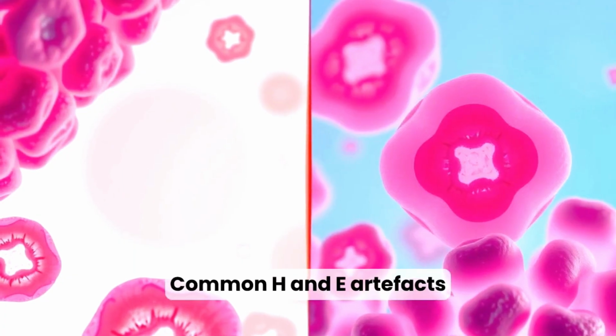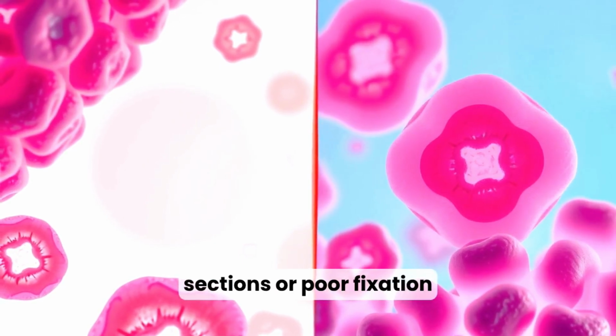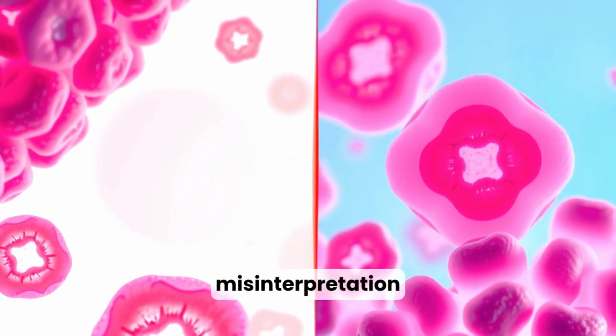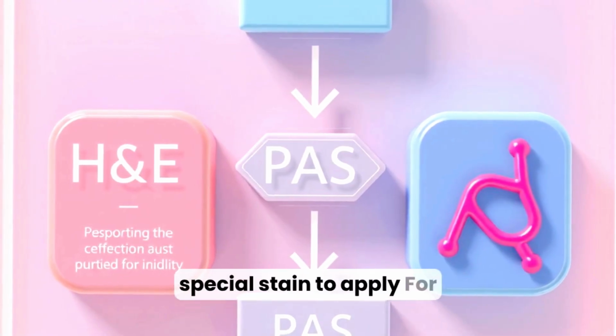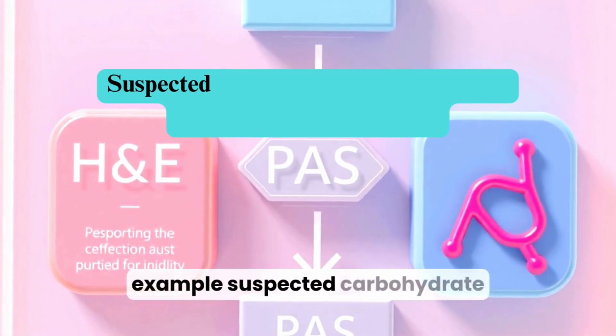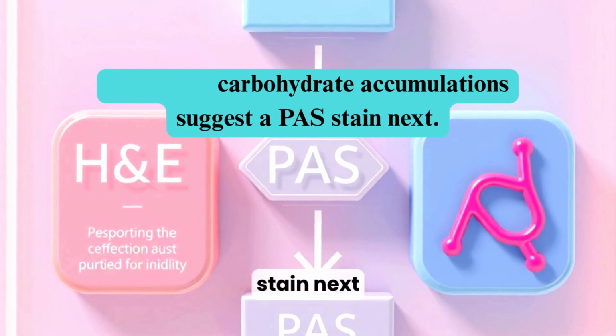Common H&E artifacts include overstaining, uneven sections, or poor fixation. Recognize artifacts to avoid misinterpretation. H&E often tells you which special stain to apply. For example, suspected carbohydrate accumulations suggest a PAS stain next.